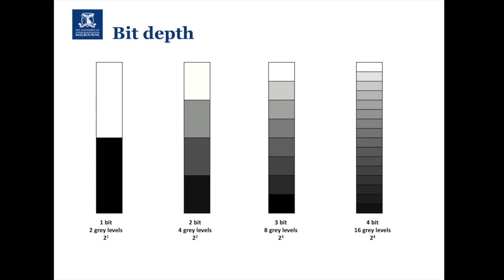So what is bit depth? It's basically the number of grayscale values that we're going to split up each individual pixel into. So what intensity ranges there are. In a 1-bit image, you've got 2 to the power of 1, which gives you 2 colors. This means there's either 0 intensity or maximum intensity. And this is what we call a binary image, and we'll use those in the FIJI for quantification workshop.